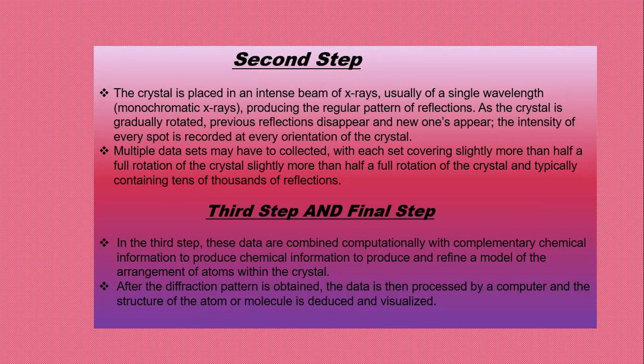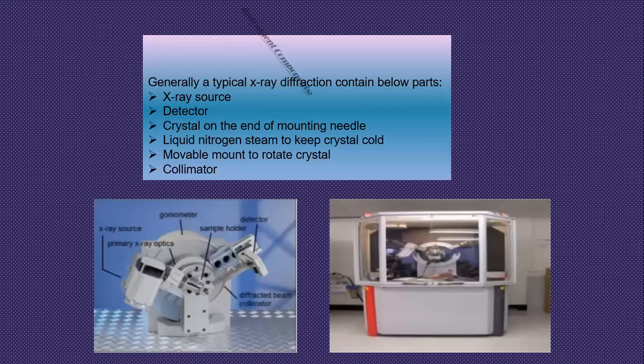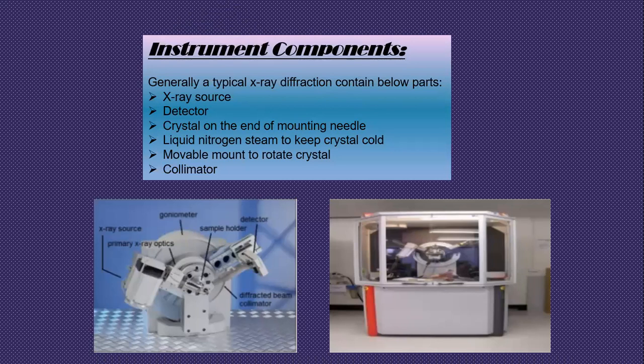And next is the instrument components. These are the instrument components used in X-ray diffraction. Generally, a typical X-ray diffractometer contains the following parts.